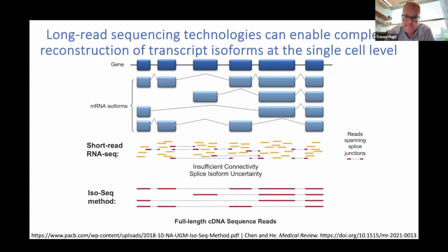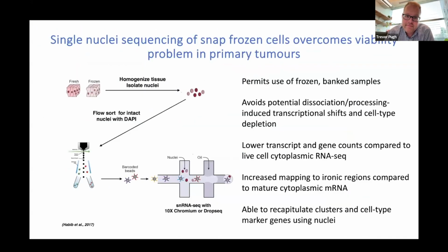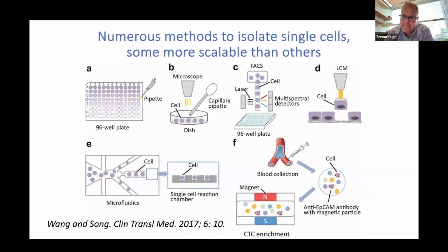Interesting, because we don't use FACS or the 10x oil-based approach. We have a collaborator that does that, but we use the BD Rhapsody cartridge for our isolation instead of oil droplets. So maybe AbSeq is just more compatible for that or something. Yeah, it might be a microfluidic chip as well. There's a few ways to engineer that.